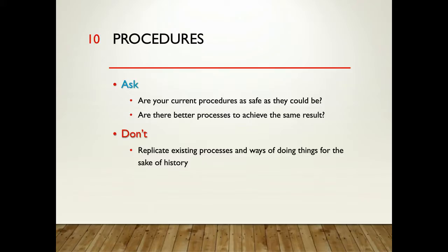So as far as your procedures go, you want to ask, are your current procedures as safe as they could be? Are there better processes to achieve the same results? But you want to make sure that you don't just replicate existing processes and ways of doing things for the sake of history, just because you've always done it that way. This is a chance to look at those things and decide, is there a better way to do this than the way we've been doing it? Is there a safer way?